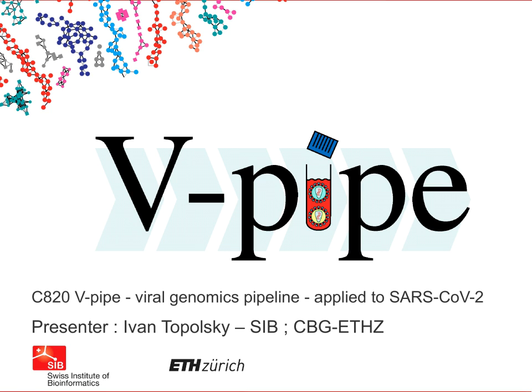Hello, my name is Topolsky. I work as a software developer at the Swiss Institute of Bioinformatics, and in this poster I'm going to show the work that has been done in our computational biology group at ETH Zurich on V-Pipe, our viral genomic pipeline, as we are currently applying it to SARS-CoV-2.